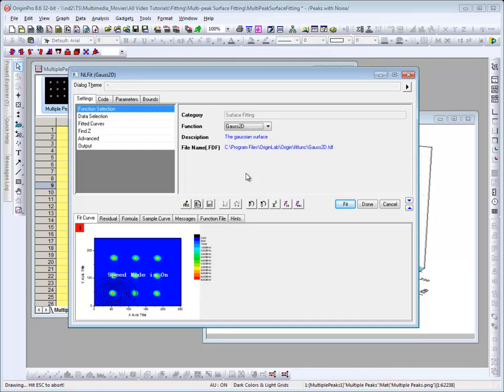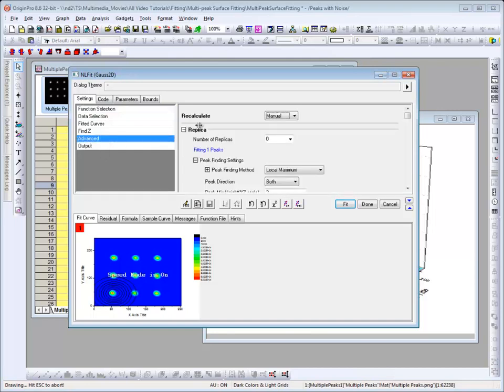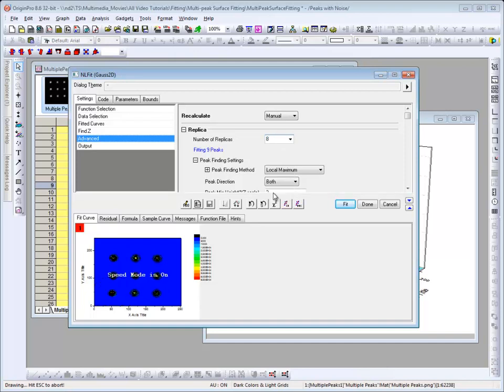The default is for Origin to fit only one peak on a surface. Here in the preview window, we see the lower left peak has been aimed in on by the fitter. To specify more peaks, we go to the Advanced tab and then specify some number of replicas. In this case, we have one original peak and eight replicas to make nine total peaks. The preview adjusts accordingly and now we see that there is a fit on top of each of the peaks.